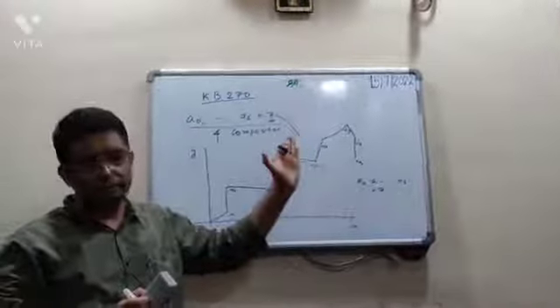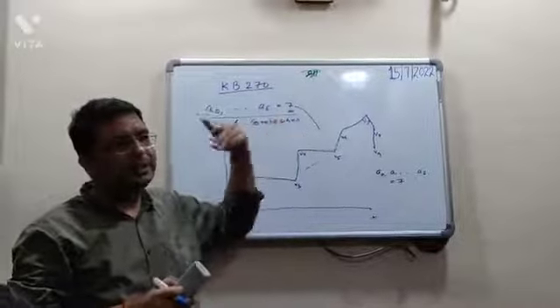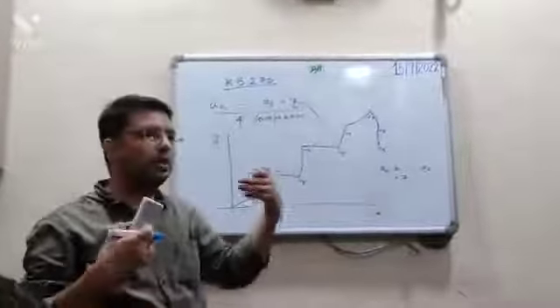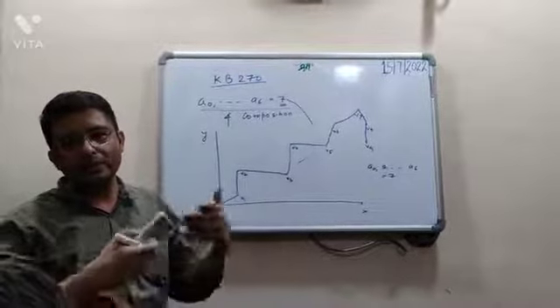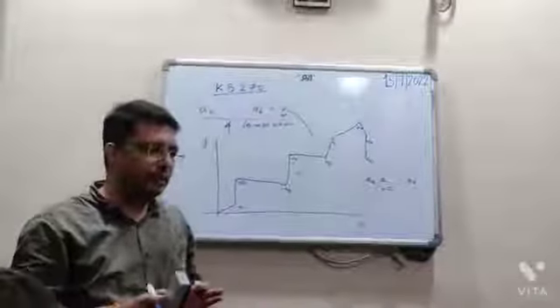plot. I am not saying that you cannot. Minimum 9 is required. So that is their constraint, the instrument's constraint. It's not like you cannot do it. You can do it with 2 points also, but it is the instrument's constraint. Right? So we have to work according to the constraint of the instrument. So getting my point or not?